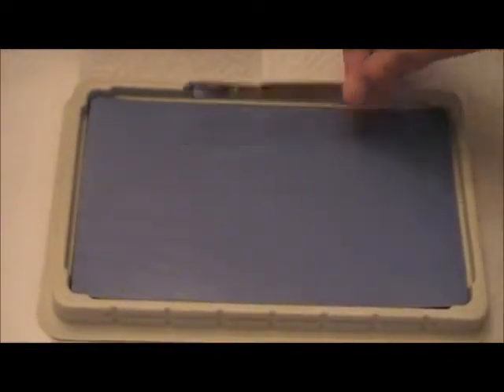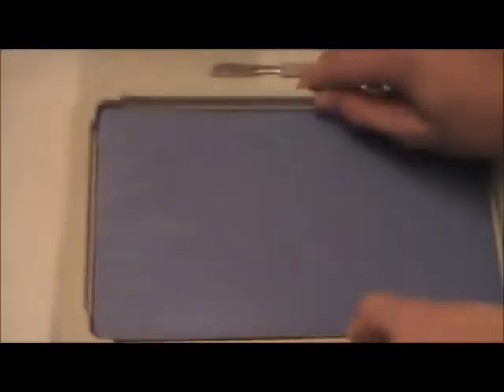Another thing you're gonna need, or would be nice to have, is this little tray I got from Home Science Tools. This rubber here is really heavy. You can pin the T-pins in here so you can hold it in place. So I'm going to go ahead and open up the worm.